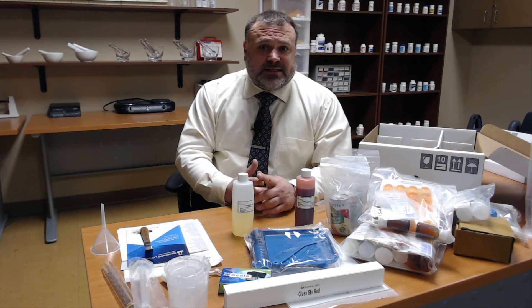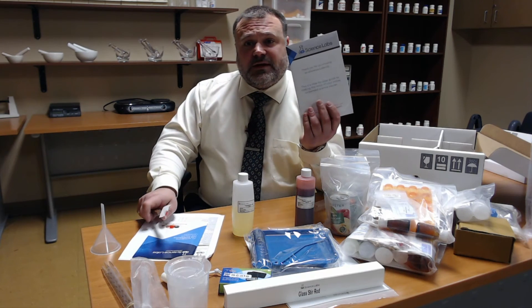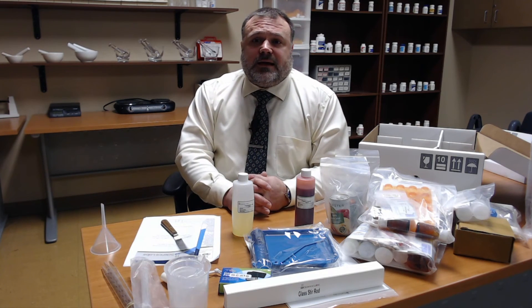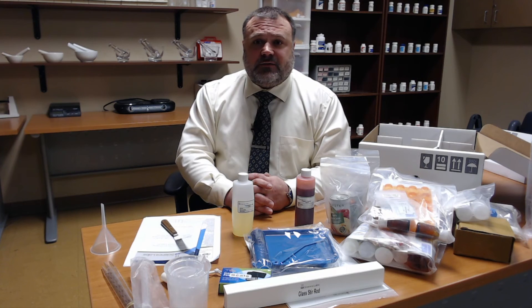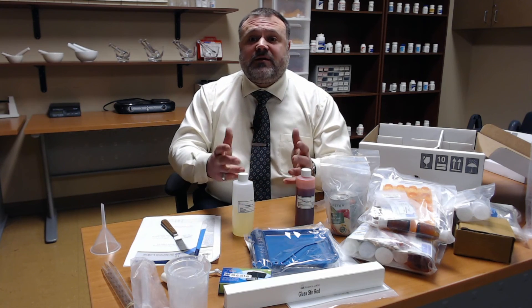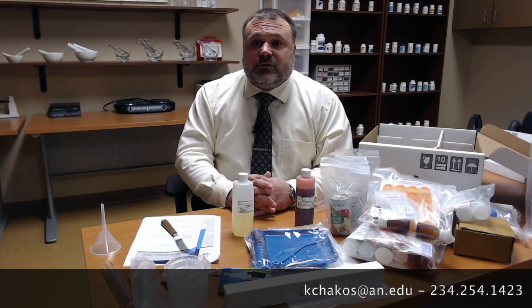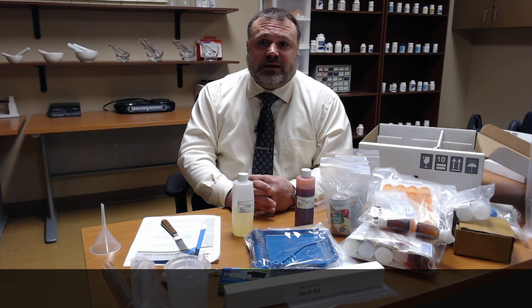If anything is missing as you go to complete your labs, or if anything is broken or in error, there is a process for requesting replacements which can be found in the eScience lab kit itself — they will replace anything that's needed. You will be going through these labs in two different classes: the first class will be Community Pharmacy Operations and Laboratory, known as PTA 176, and you will be completing the other half of the labs in PTA 276, Institutional Pharmacy Operations and Laboratory. I hope this gives you an idea of what you're going to be looking at when you receive the eScience lab kit. If you have any questions, please don't hesitate to call or email me. Thanks.